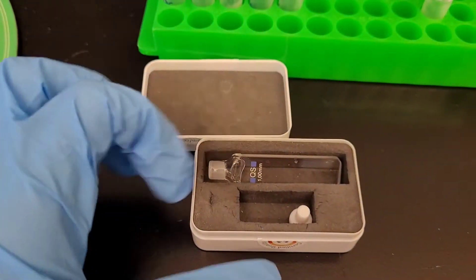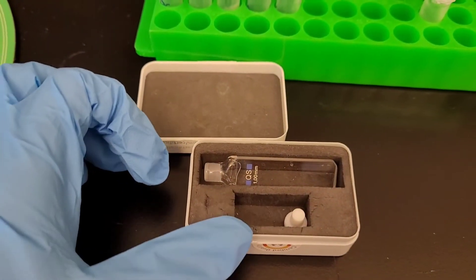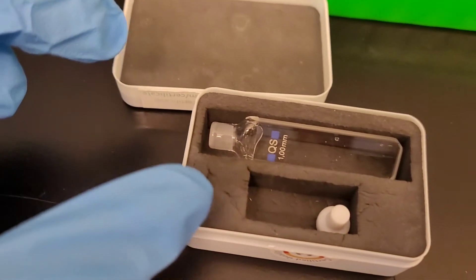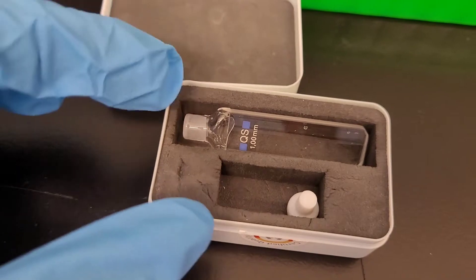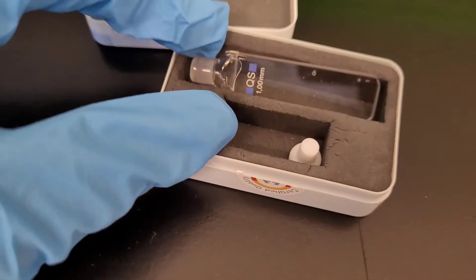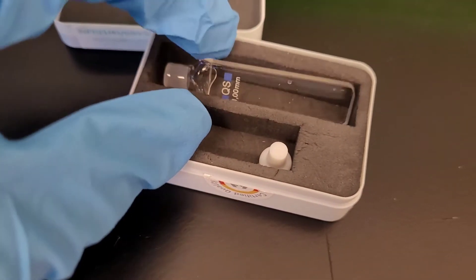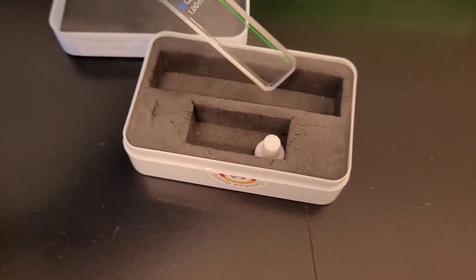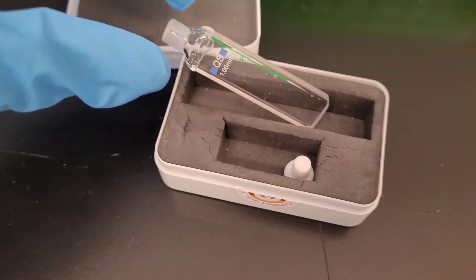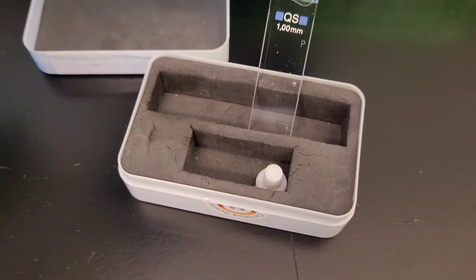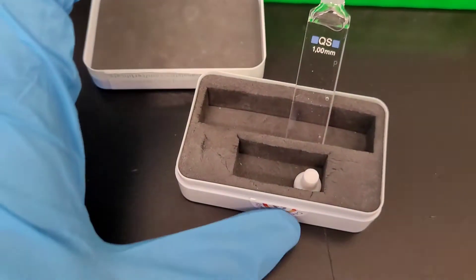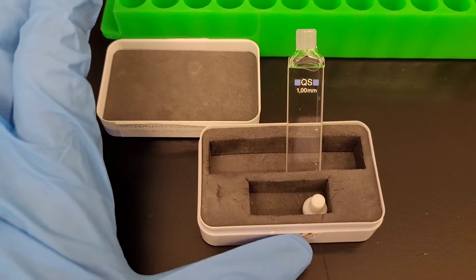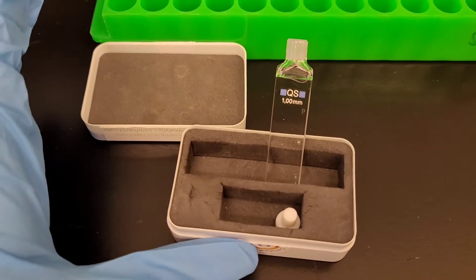The cuvette that is used for CD looks like this. First you have to make sure that you clean it well with ethanol and then water. So this is what I'm going to do right now.